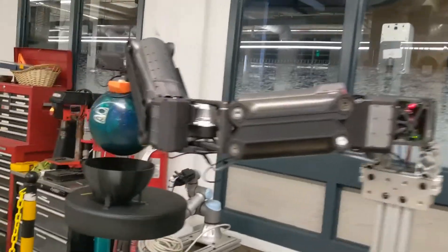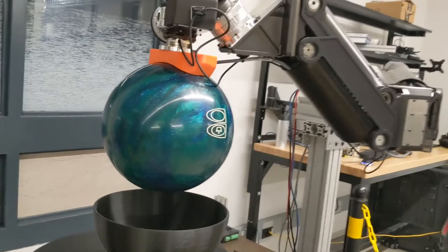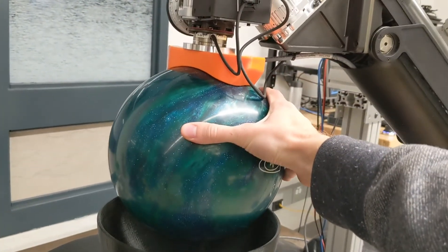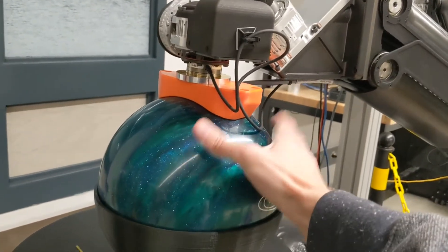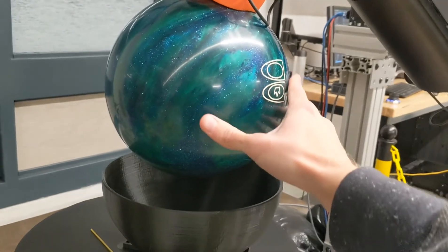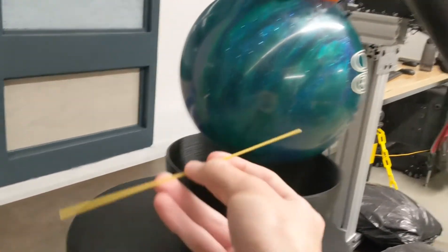So you're probably wondering what on earth I'm doing attaching a bowling ball to a very expensive robot. Well, I'm not teaching it how to bowl. In fact, what I'm doing is replicating a process across some Department of Energy facilities where a heavy spherical object needs to be dropped into a hemispherical mating cup. And the object also is going to have a fragile pin at the bottom, which I'm representing with a spaghetti noodle.